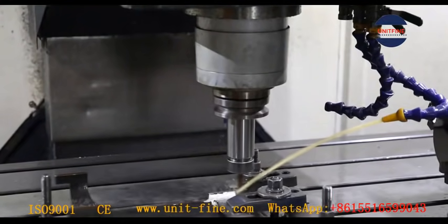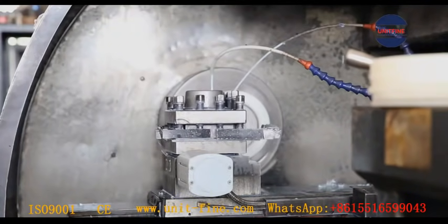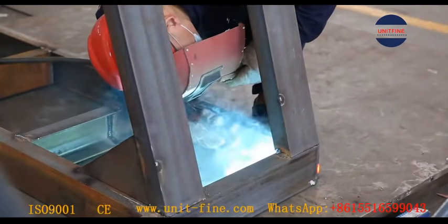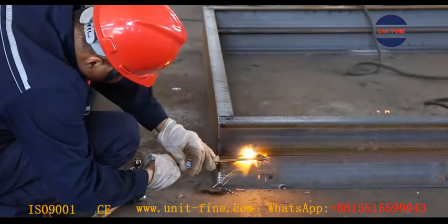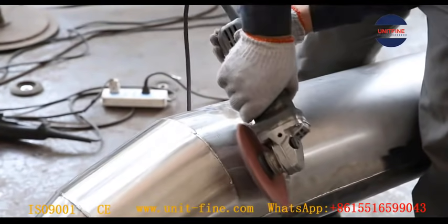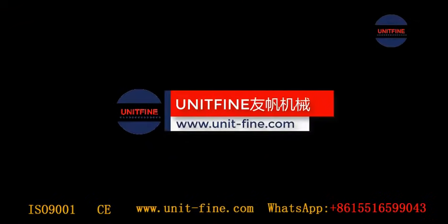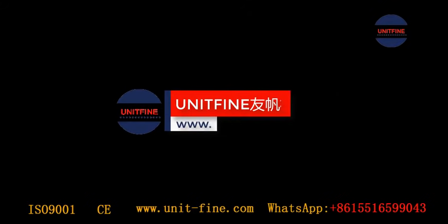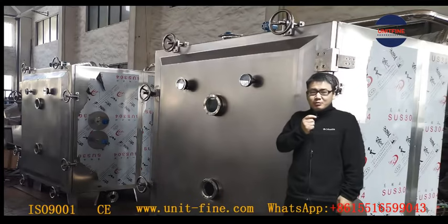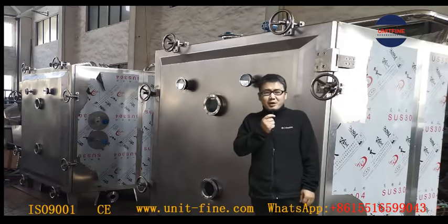Hi, welcome to Unify, this is Xinba Zhao. Today I am going to do a pre-delivery inspection for one of our customers. He cannot come to the site because of the Covid situation.